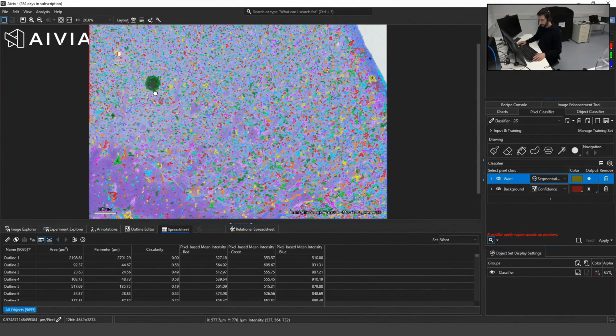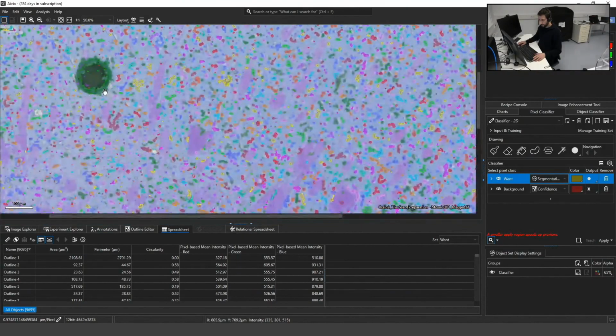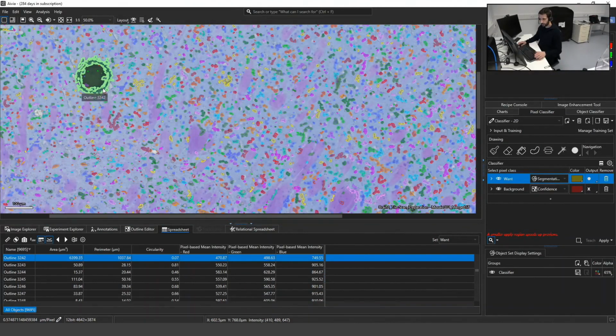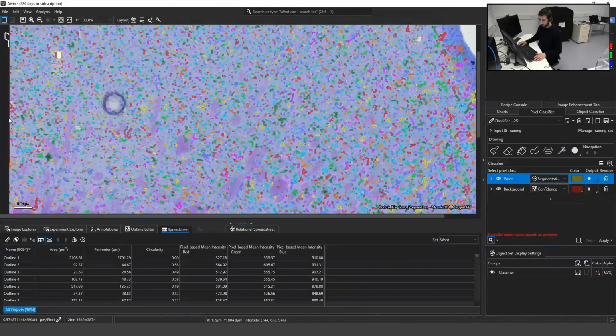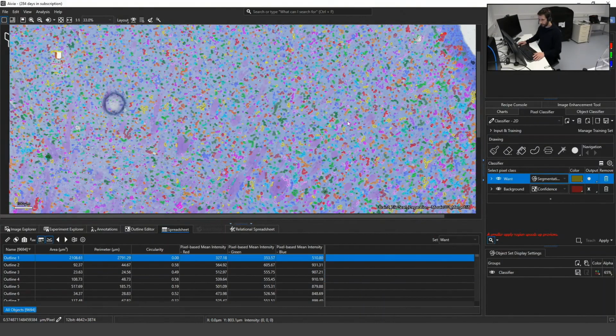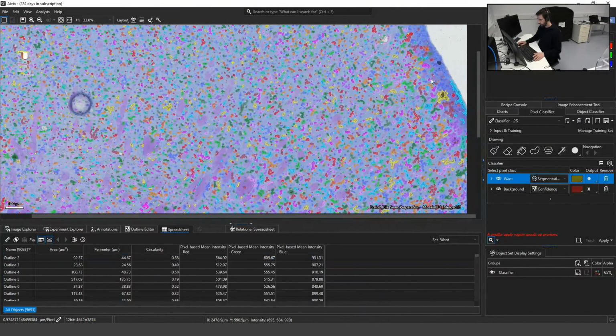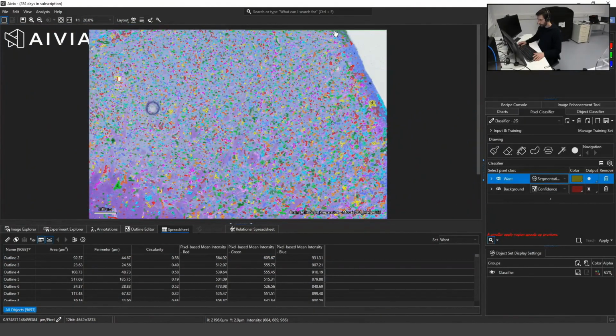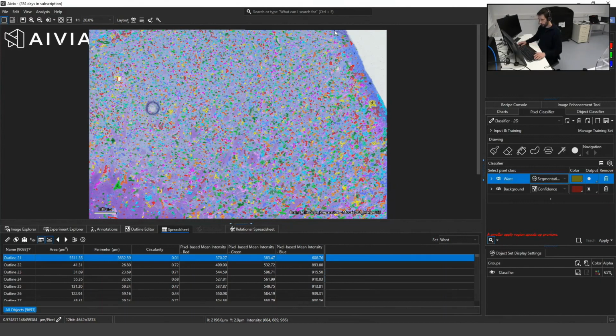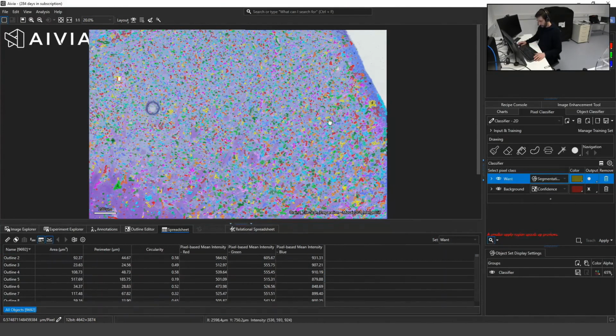And from there, I can now identify or activate regions, as you can see right here. So this is just an air bubble, which I just delete. And there's more on the side here, which I just delete. Let's go to the other side. Is there more we don't want? I think here on top. This we just delete. And I think with this we can already go.